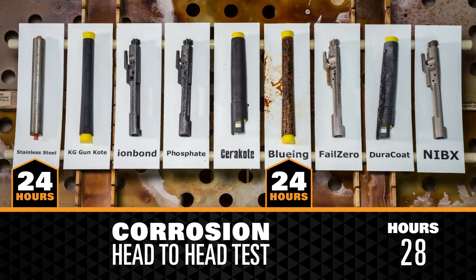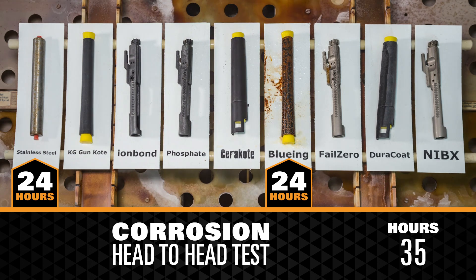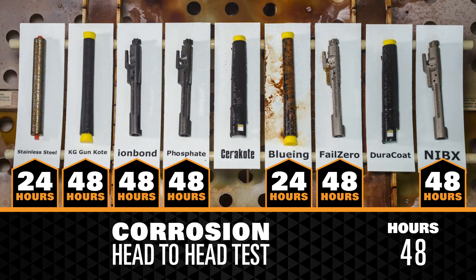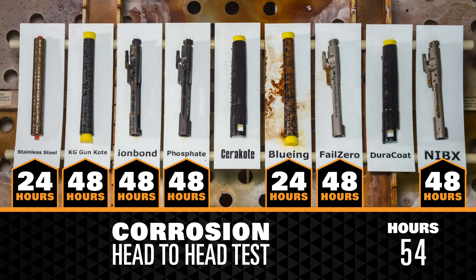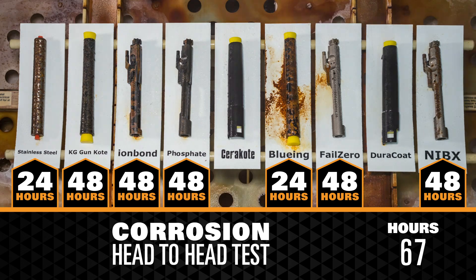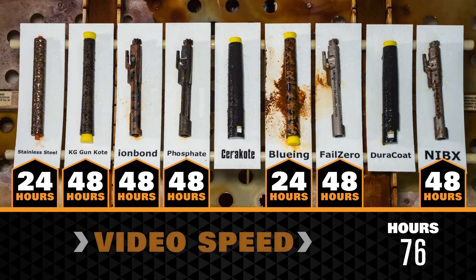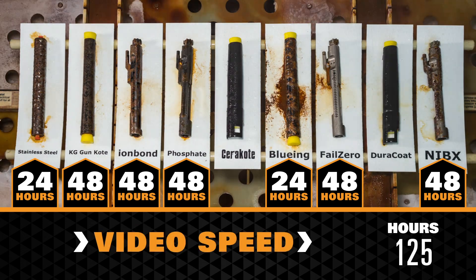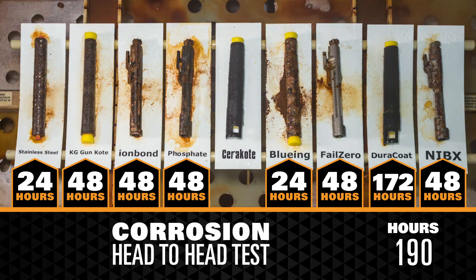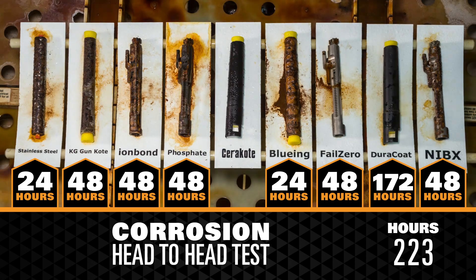Bluing and stainless steel showed visible signs of corrosion within the first 24 hours. Corrosion was visible within the first 48 hours on Fail Zero nickel-boron coating, Ion Bond, phosphate, and KG Gun Coat. Within 172 hours, DuraCoat began to show signs of corrosion.